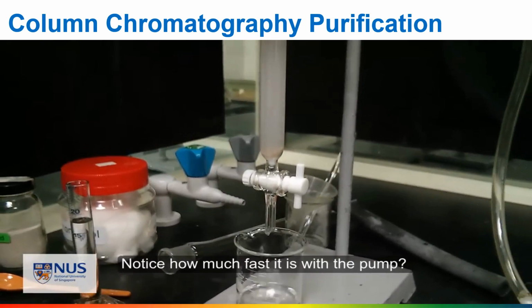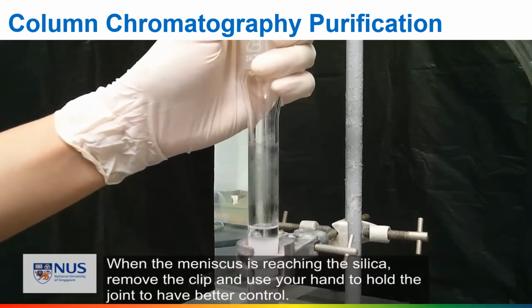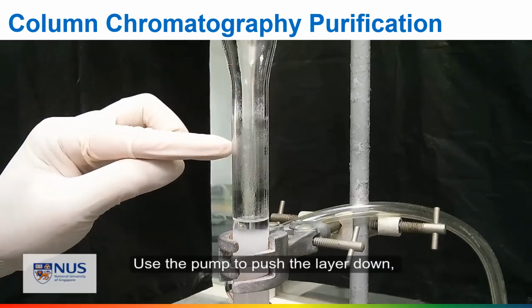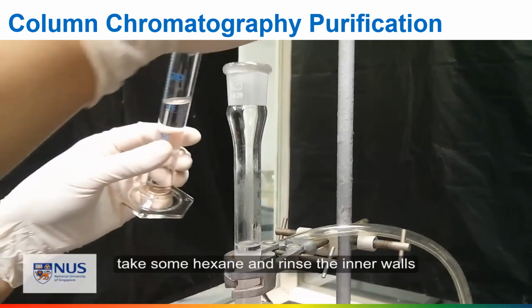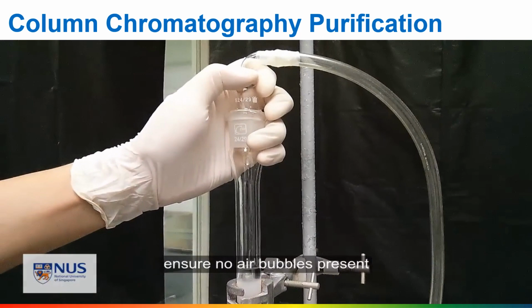When the meniscus is reaching the silica, remove the clip and use your hand to hold the joints to have a better control. Use the pump to push the layer down. Take some additional hexane to rinse the inner walls of the column, and make sure there are no air bubbles present. At all times, the column must be upright.